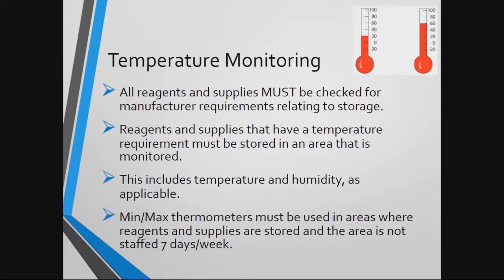Temperature monitoring is the next hot topic we will talk about today. Anything that has manufacturer's instructions mandating that a particular reagent and/or supply be kept at a certain temperature must have temperature monitored on a regular basis. This includes both temperature and humidity. So always make sure you are checking those manufacturer's instructions for temperature requirements.